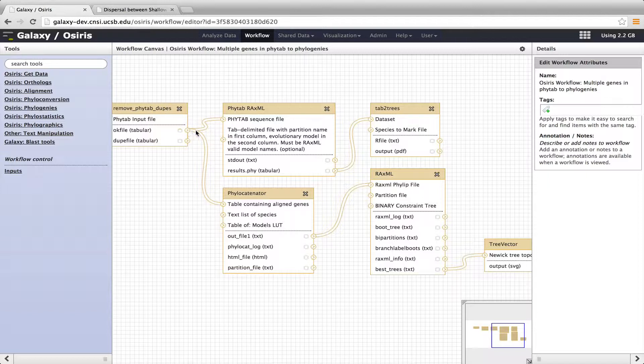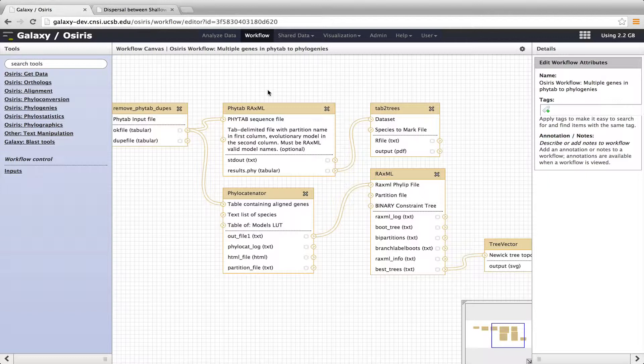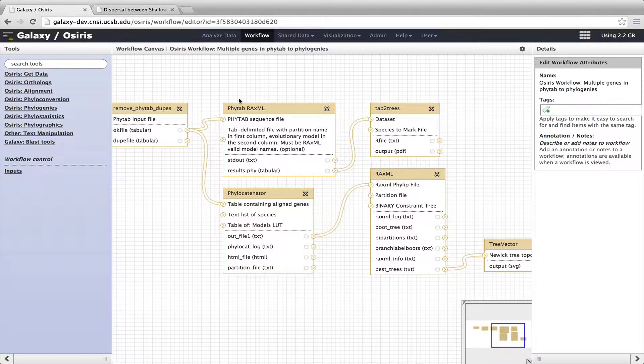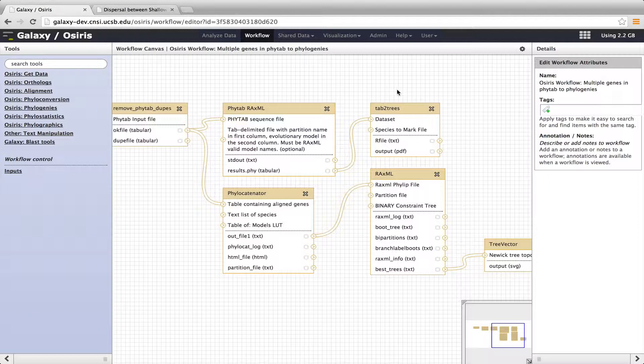So first, it will put the output of Remove PHYTAB dupes into PHYTAB RaxML. So what this does, it's another PHYTAB tool, and it implements RaxML, and that is a tool for generating a maximum likelihood phylogeny separately for each of the genes within the data set. So we get a gene tree for each of the different genes all with one tool. Then that gets passed out into a tool called Tab to Trees. And now this, the output of PHYTAB RaxML is multiple different gene trees, and Tab to Trees will generate a graphic for each of those gene trees in a book that is within a PDF. And I'll show you the results of that after we run this.